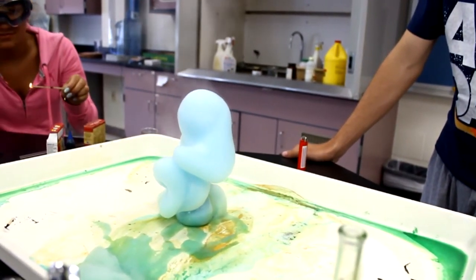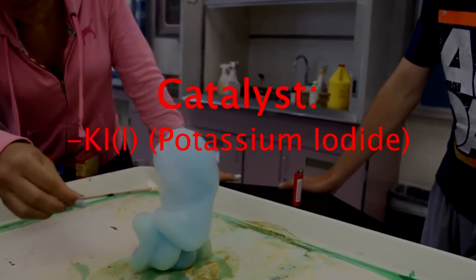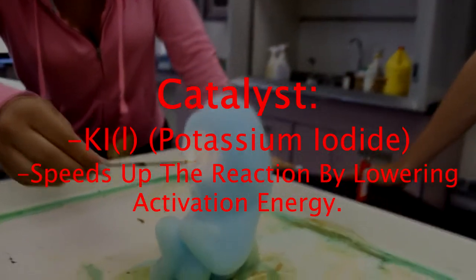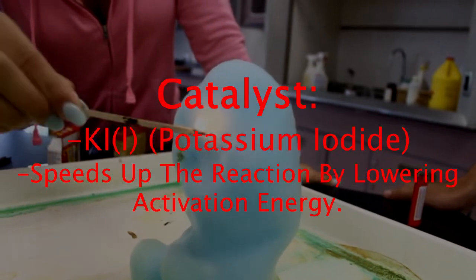One of the other things that we do in this experiment is add potassium iodide as a catalyst. That's the solution that you see us pouring into the top. The catalyst lowers the activation energy for the reaction so that it can proceed faster and quicker.